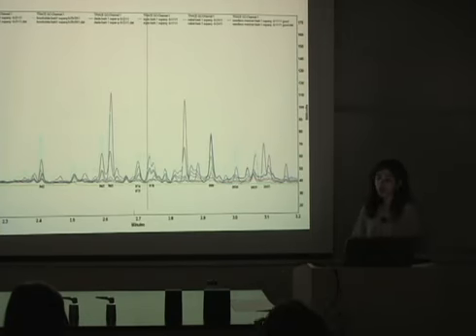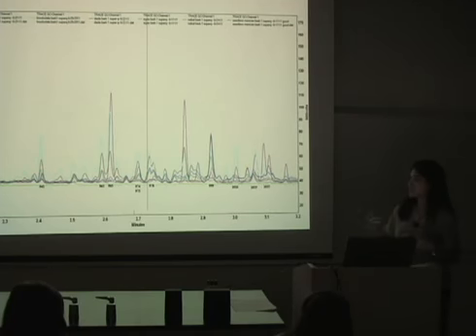So finally, because I showed differences and similarities, I wanted to show how the information comes out in the computer. The information comes out in the computer as, this is called the gas chromatogram. From the gas chromatogram, as far as I can see, I see more similarities actually than my data analysis told. Each color, each peak in a different color represents a different cultivar.